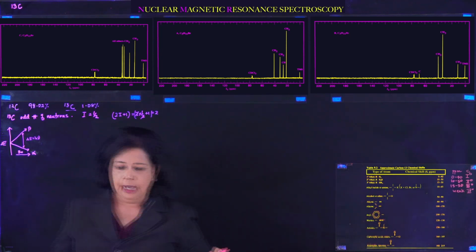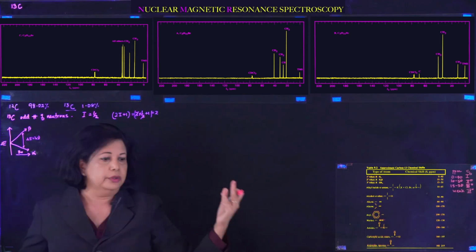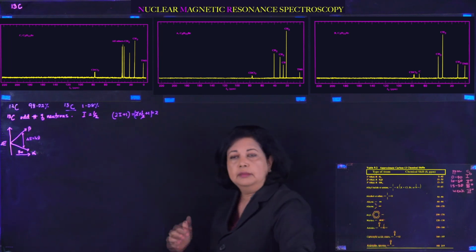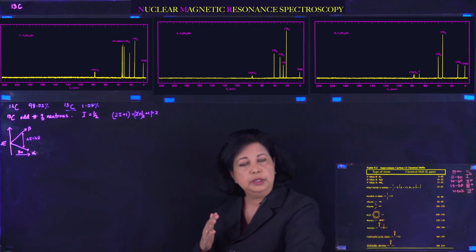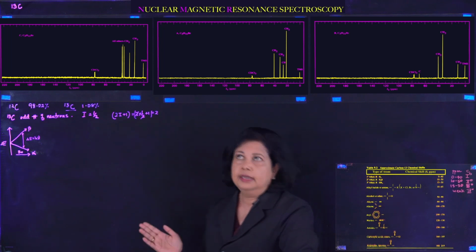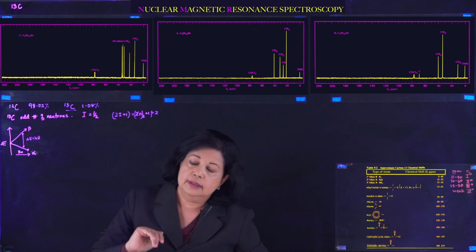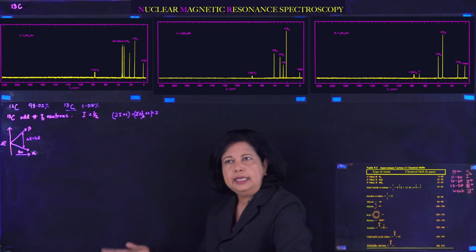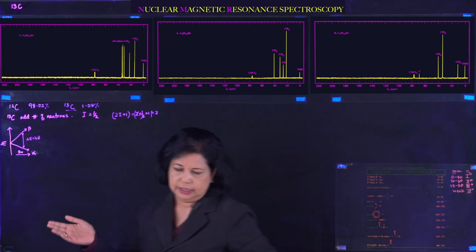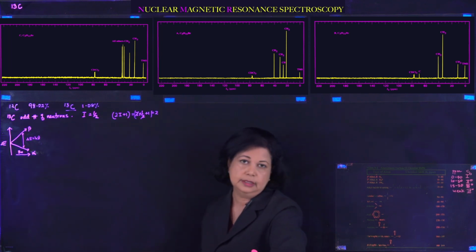Now, if you have a NMR, for carbon-13 NMR, and you want to run it, you have to do multiple scans. Sometimes you do it overnight, 240 or more, to get these signals to show up above the noise level. Proton NMRs don't need that many scans, 16, 32, 64, and so on, depending on how concentrated the sample is.